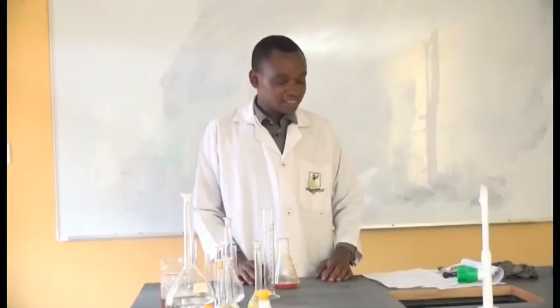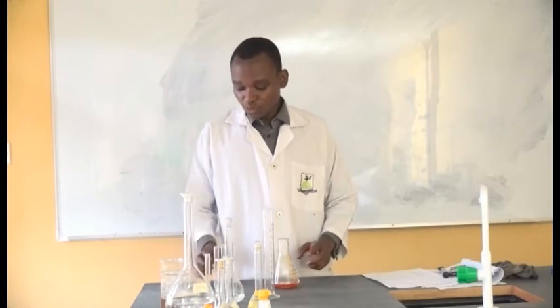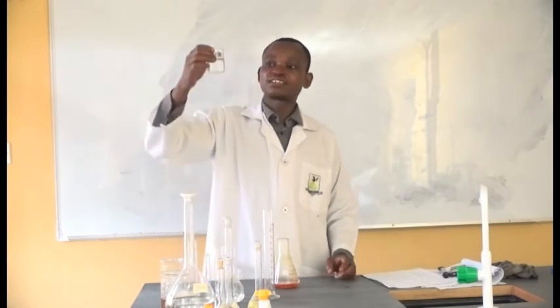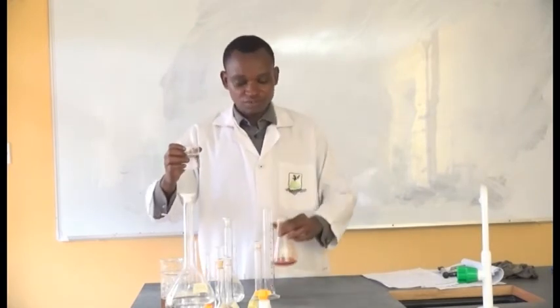After adding the potassium iodide, we will now add 50 ml of distilled water. We have our distilled water here, and I am going to add 50 ml of it into the conical flask.